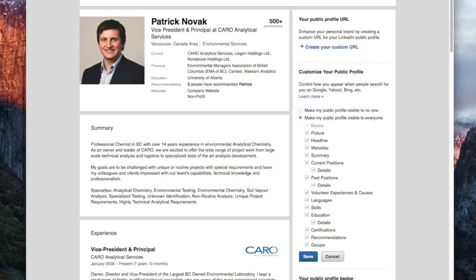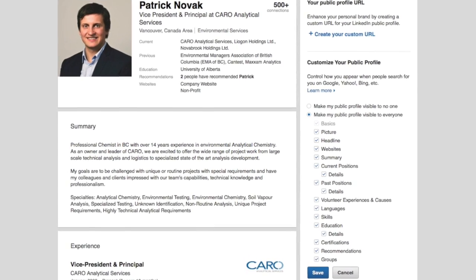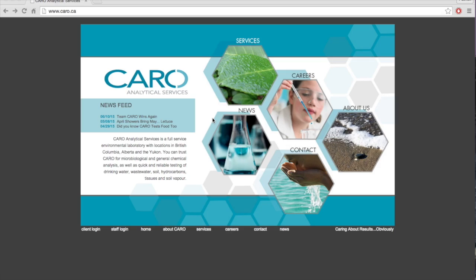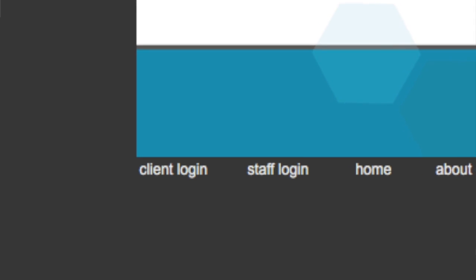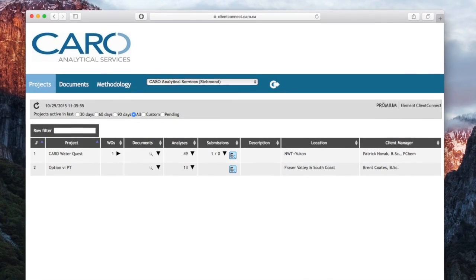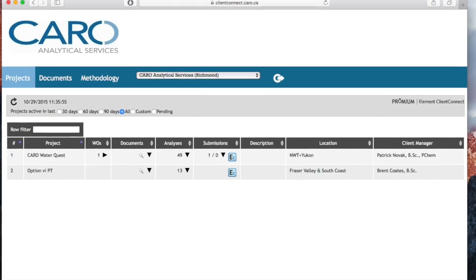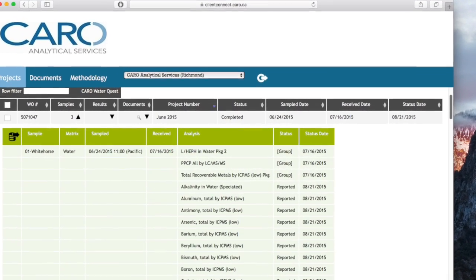My name is Patrick Novak and I'm the Vice President of CARO, and I'll be taking you through this exciting new service we are making available to clients. Client Connect is designed to allow our clients 24-hour access to their analytical data, complete with real-time status updates, analysis information, bottle and supply information, and trending tools for your data sets.